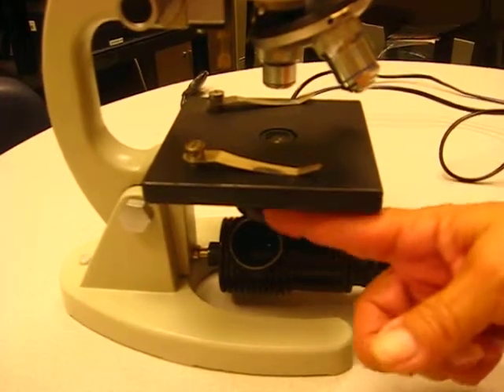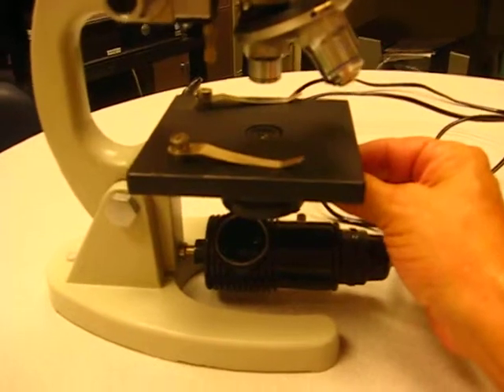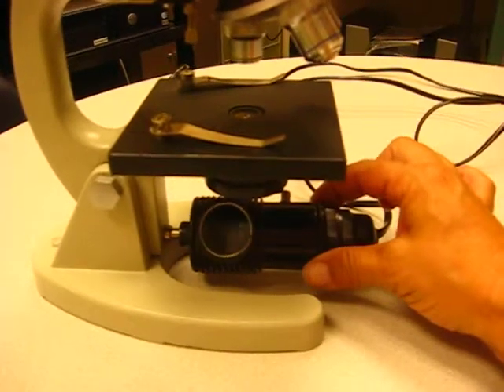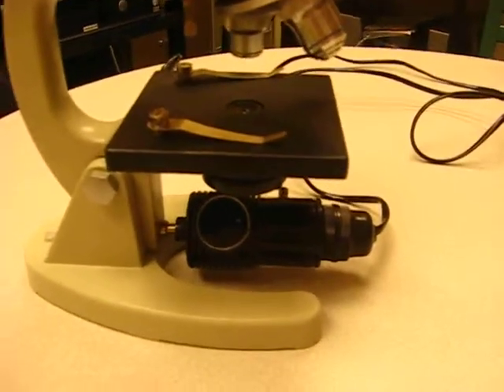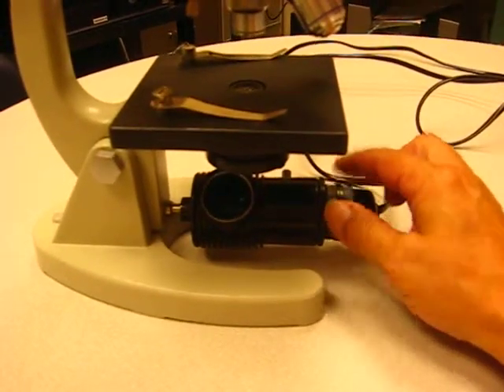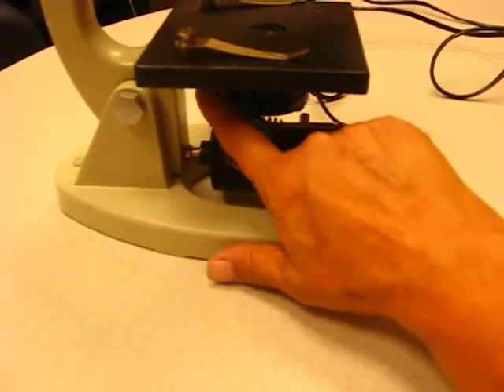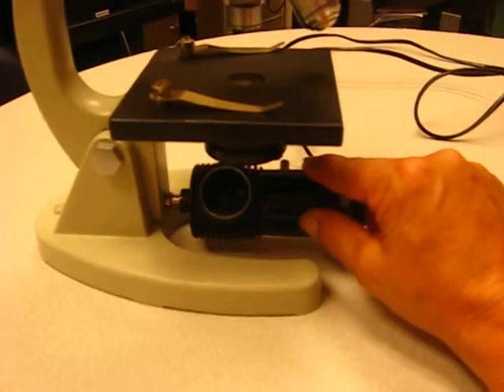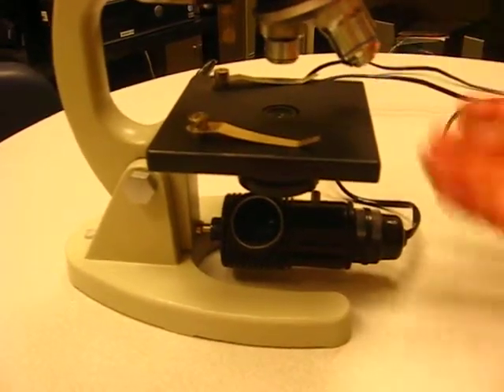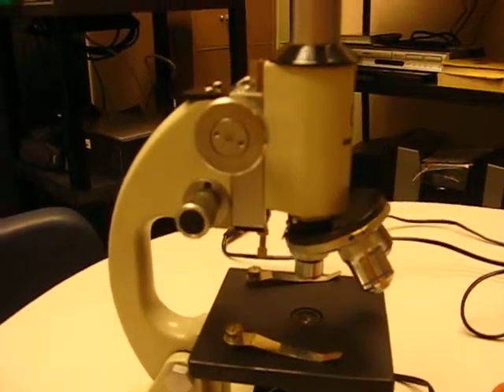Underneath is the diaphragm, which controls the amount of light coming in depending on how much light you need to see your particular specimen. This microscope has a light underneath — I call it an illumination field or a puck light, though I'm not entirely sure what this particular one would be called. A mirror can also be used to reflect light up to let you see the specimen.